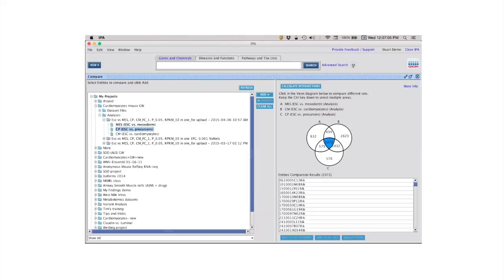If you want to then do something like show me tumor 1 versus tumor 2 instead of versus normal, you again would have to do that upstream of IPA. You'd have to create those ratios or fold changes of tumor 1 versus tumor 2, and then you could do that as an analysis, and that's a new analysis, and then that's really looking at the fold changes of tumor 1 versus tumor 2. I hope that answers your question.